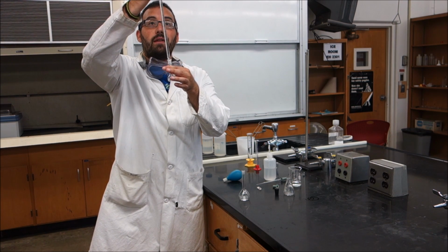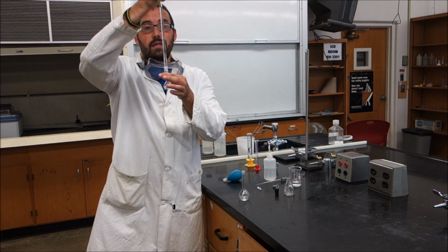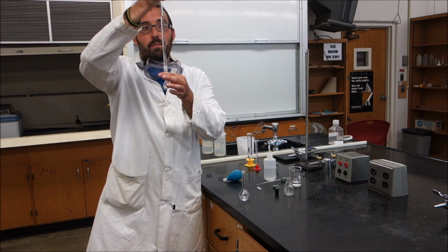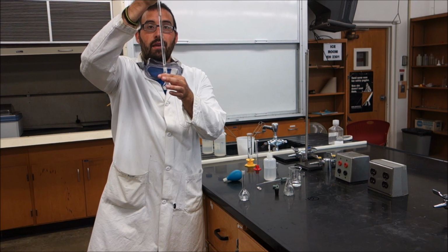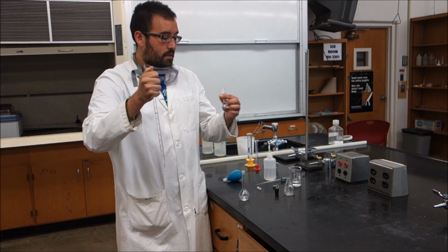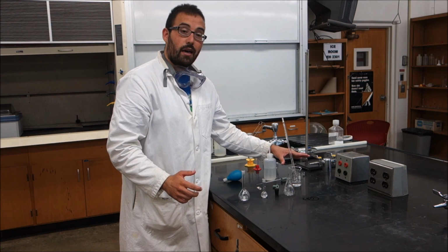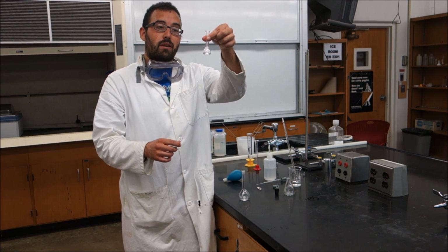So we're going to use a 10 milliliter volumetric flask. So if we want to do 2 milliliters, we're going to slowly release the pressure and then drop it down to the line. Now if you'll notice, I have the pipette up at eye level so I can see when that meniscus gets to that line. Now once it's at that line, I'm going to stop it by putting pressure again on my right hand. I'll go ahead and safely return this back to the beaker that I have it in. Now we have 2 milliliters in this volumetric flask.